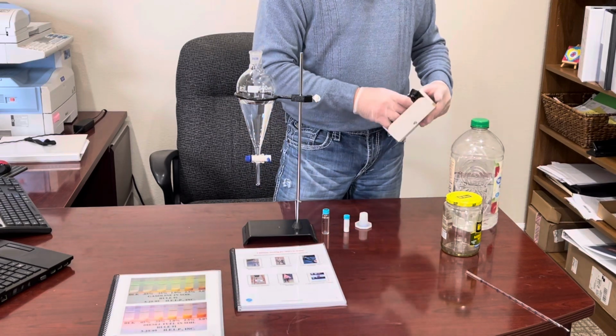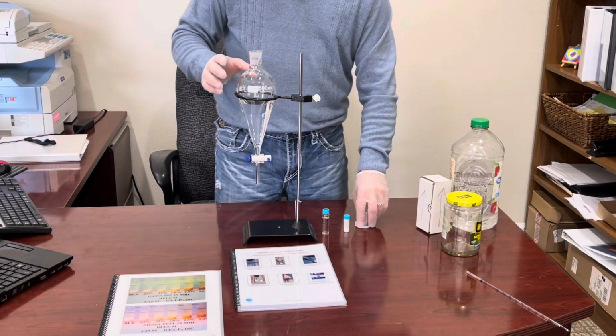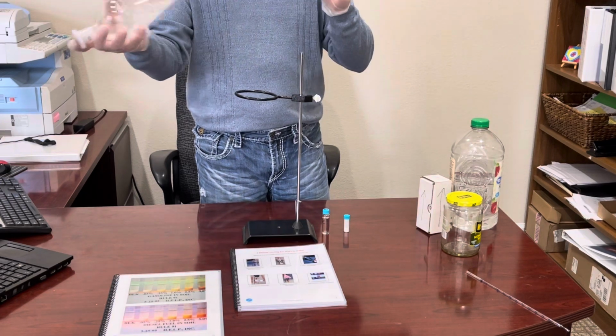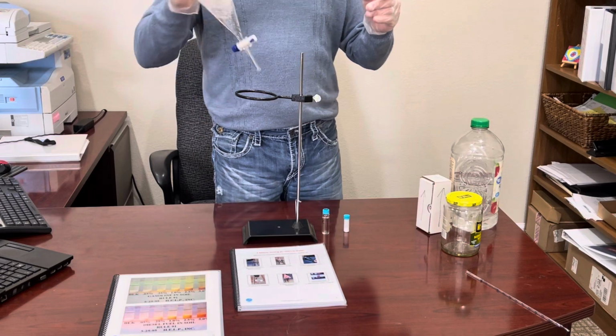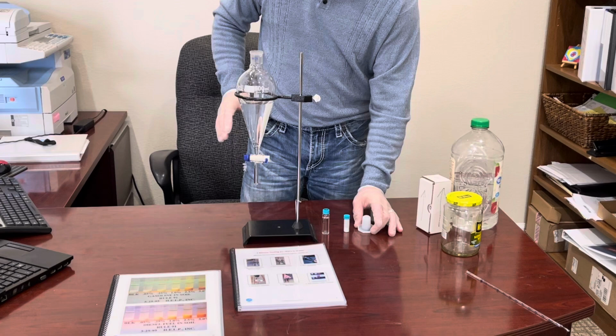And just to make sure, I can definitely smell it because I tapped it on the side there and some of it's stuck to the glass. Let's just go ahead and swirl that water around in there and make sure that our contaminant goes throughout that water sample. Okay, so we got some contaminated water with some old gasoline.